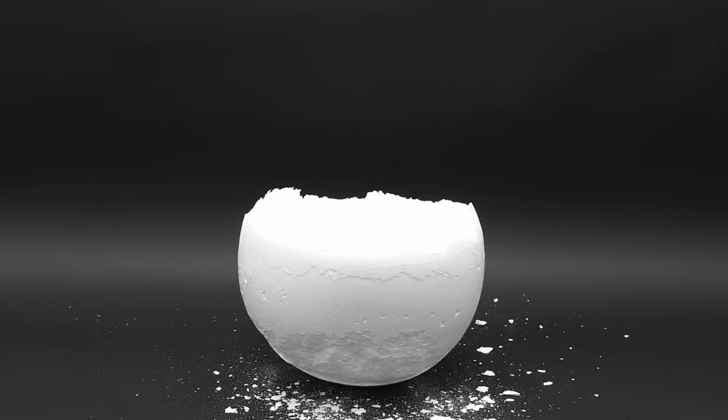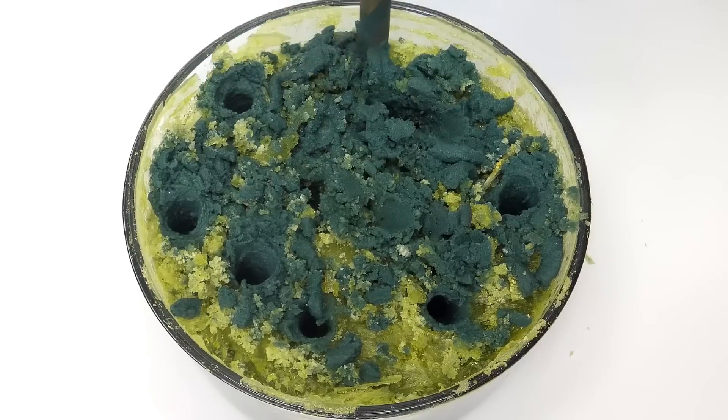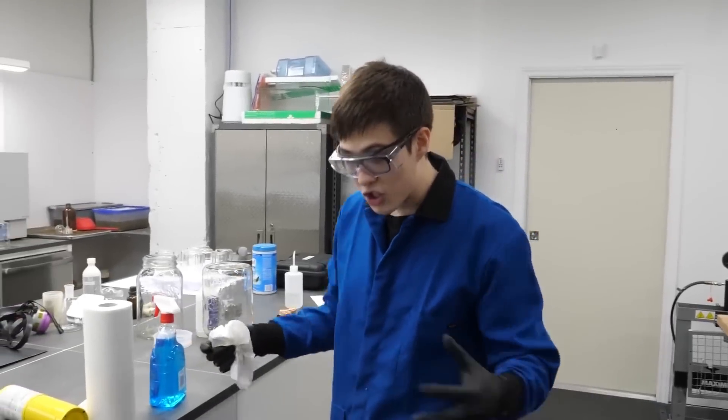I was gonna have to use a bit more force. I ended up going faster and faster, and I think I got a little bit careless. I don't think it's actually gonna shoot glass into our faces.